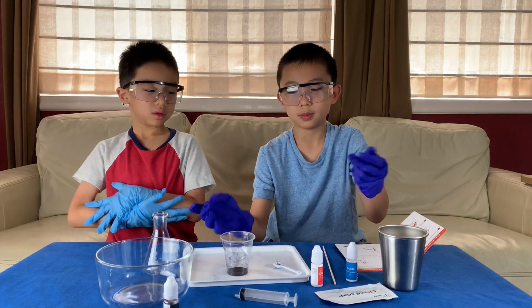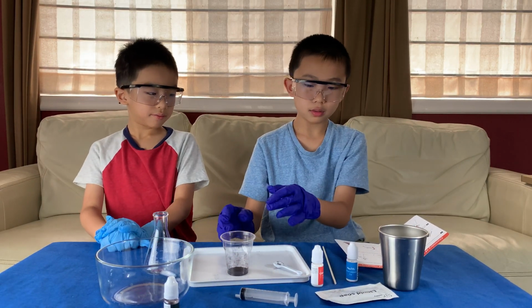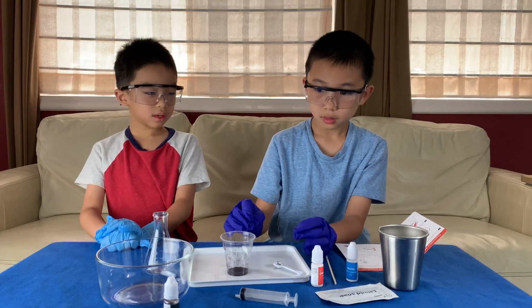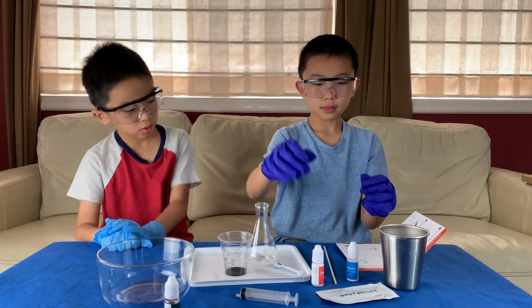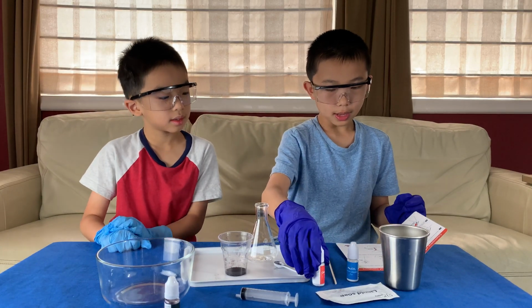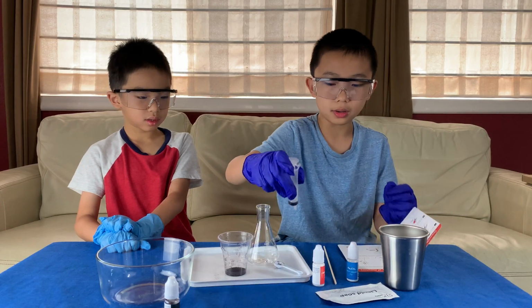Okay, that's the best I can do. Okay. All right. Next, 20 milliliters. Next, we need 20 milliliters of water.